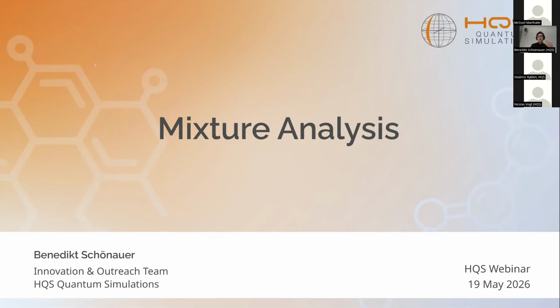We need very good component spectra, that means material-specific and solvent-specific NMR Hamiltonians. And we need to find some metric that allows us to automatically fit the component spectra to the experimental spectra and to evaluate how good this fit is.